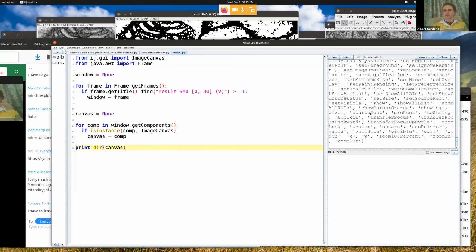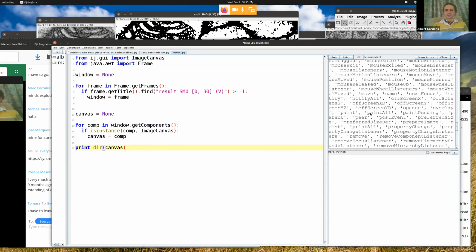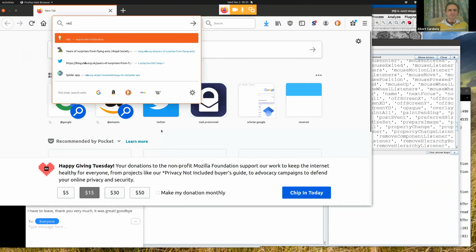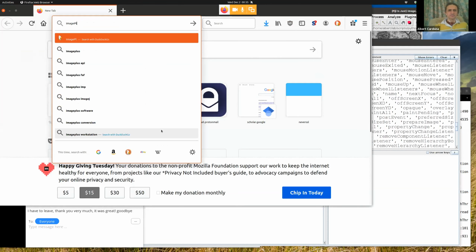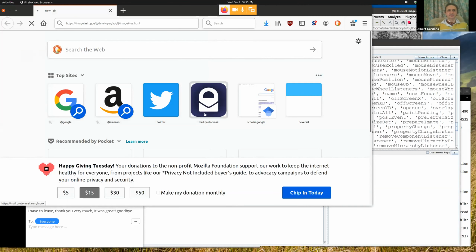There's tons of things. But actually, more conveniently, we should look at this in here. That one.